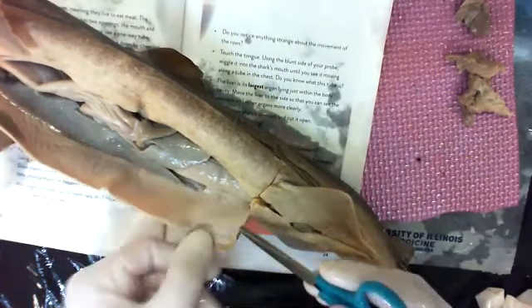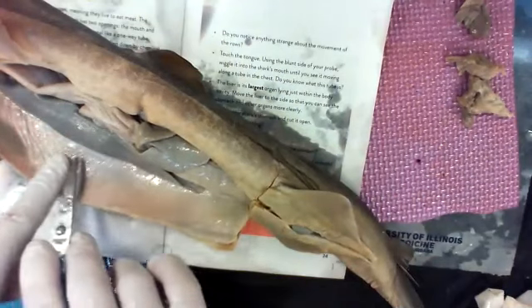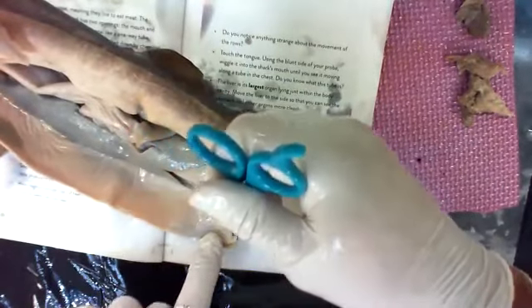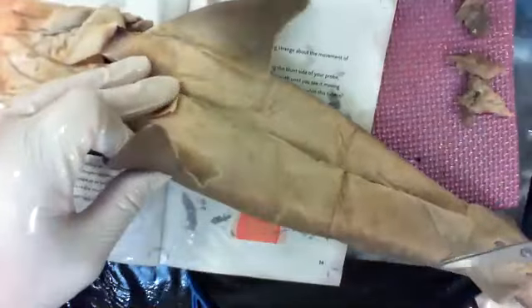So if you want, you can see that blood vessel. If you wanted to, you could cut the blood vessel out, but not right now. And you can see that it goes all the way back up to the heart. So this is called the lateral vein, actually. It's returning blood that's been used down here all the way back up into that sinus venosus to go into the heart.